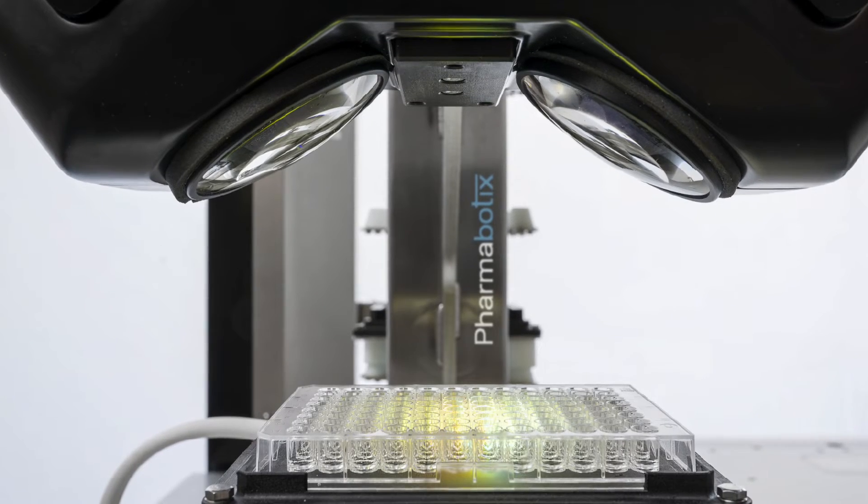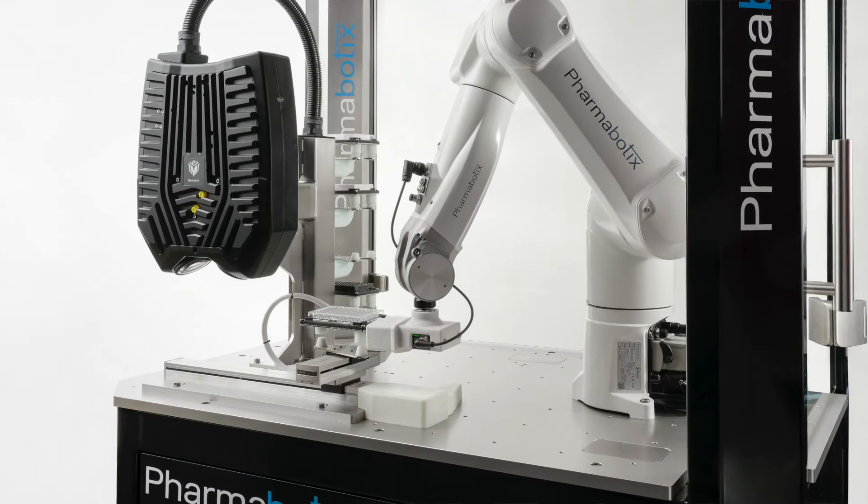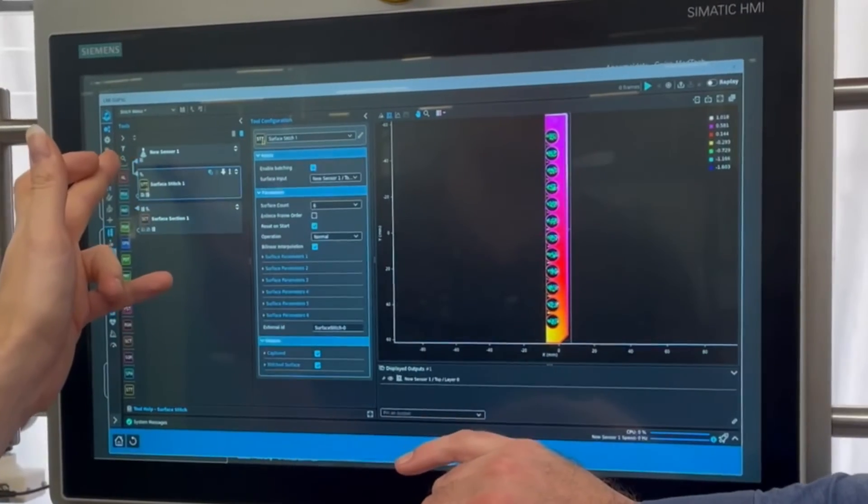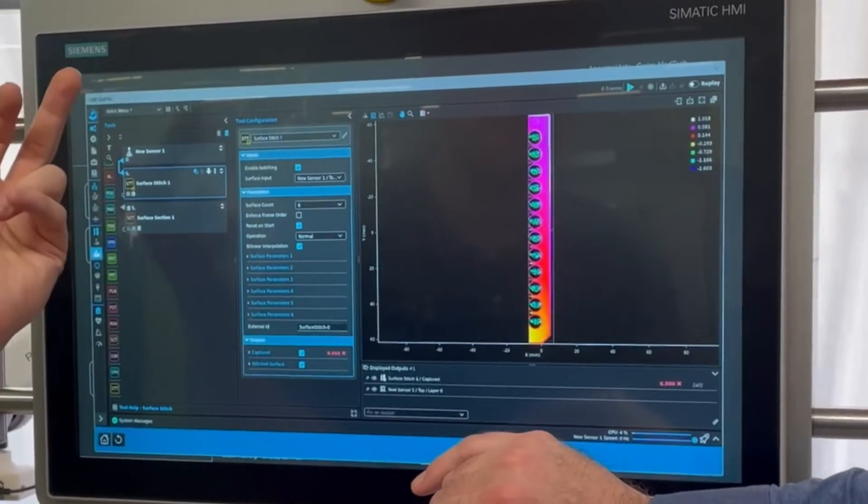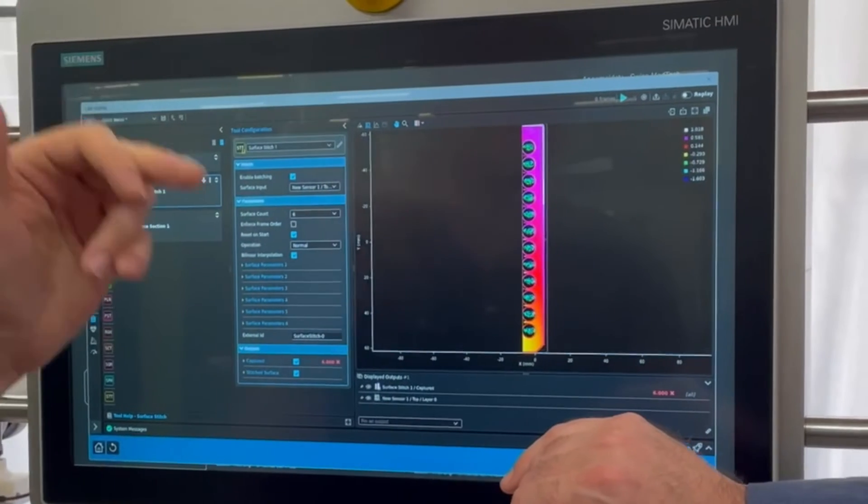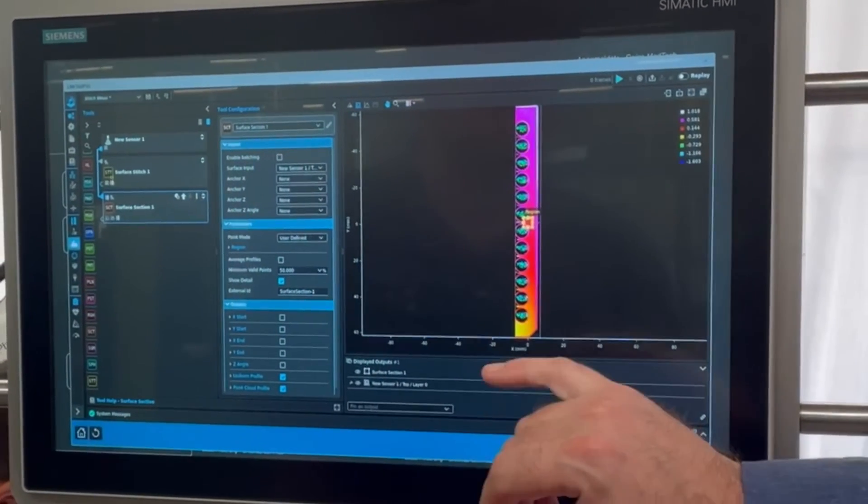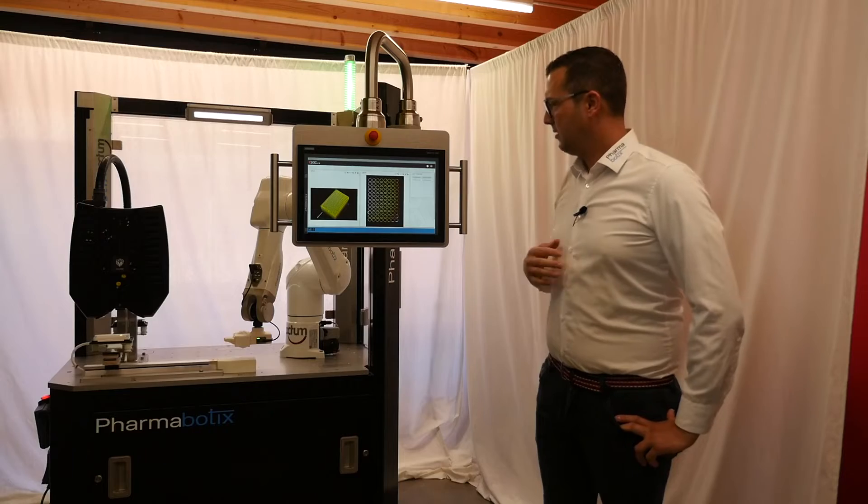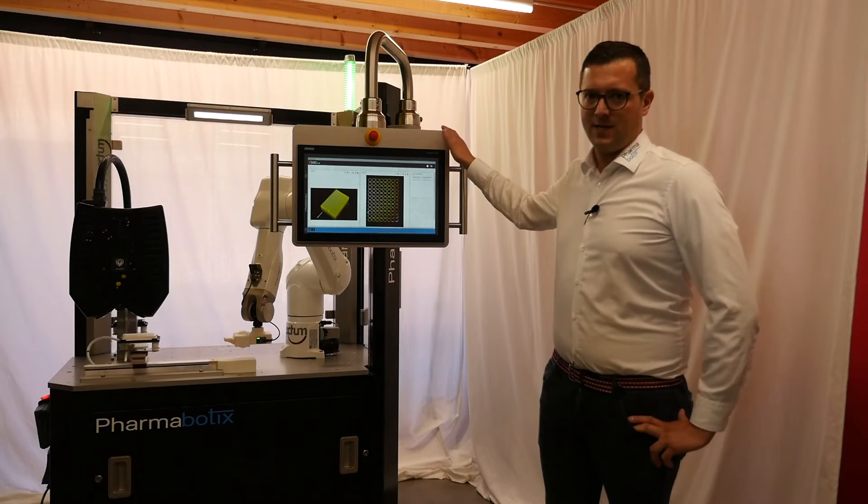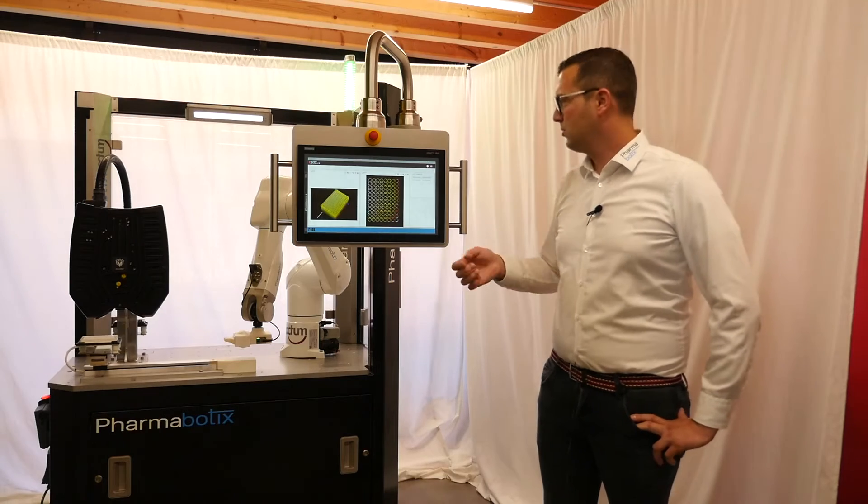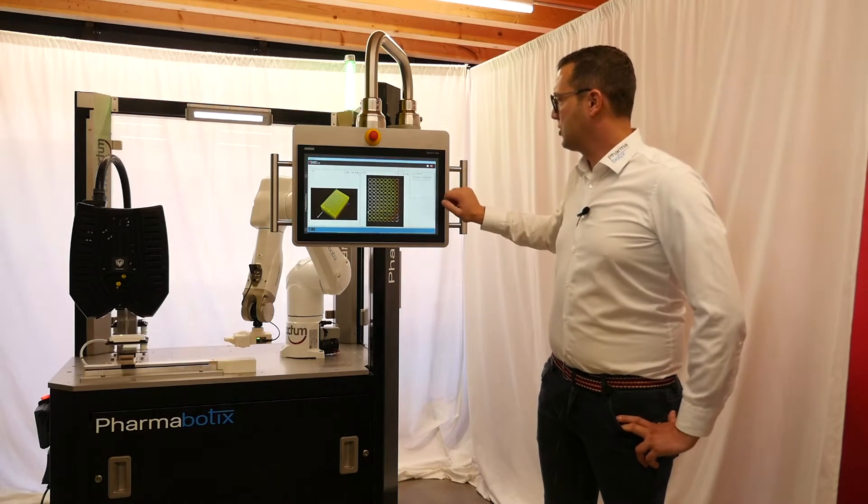This robot solution is fully integrated so not just on the mechanical side with the sensor but also on the HMI so we have the possibility to program the robot or do adjustments but we also are directly connected with the sensor and the OCTUM interface. You can open and modify the whole system from the central HMI. You don't need to connect with special software or other tools in order to make adjustments.